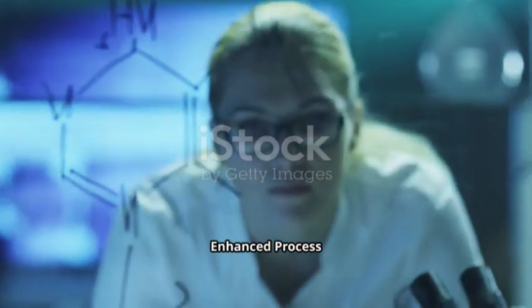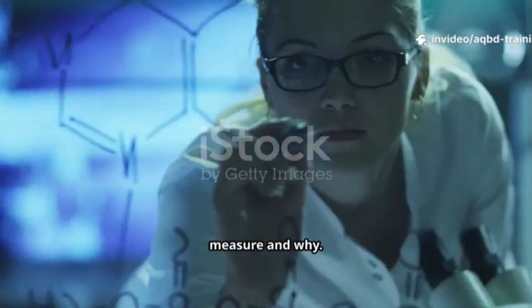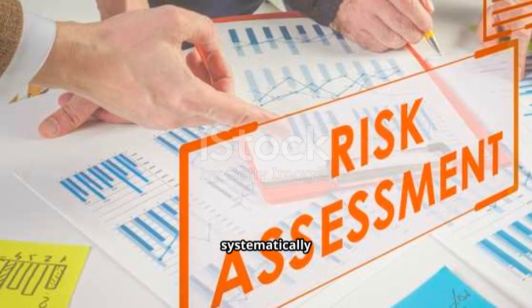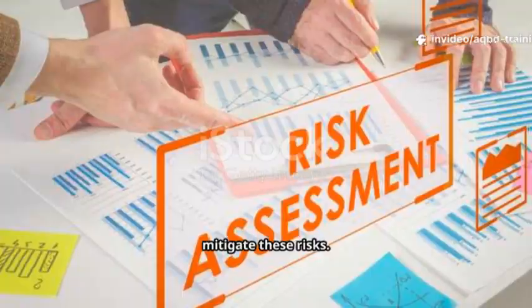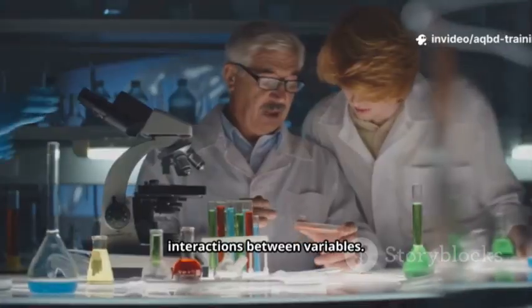First, enhanced process understanding. We must thoroughly understand what we're trying to measure and why. This includes understanding the critical quality attributes of our analyte and the potential sources of variability. Second, risk-based approach. We systematically identify and assess risks that could impact method performance, then design experiments to mitigate these risks. Third, systematic experimentation. Instead of changing one variable at a time, we use designed experiments to efficiently explore the method design space and understand interactions between variables.